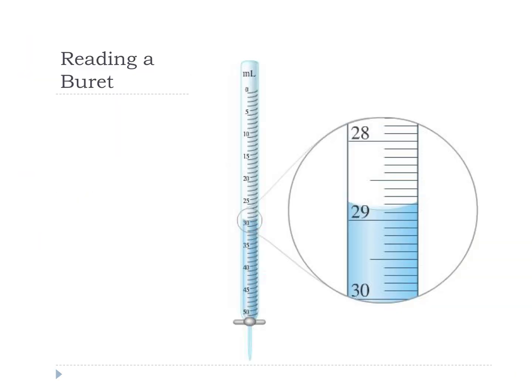At the beginning of the year, when we learned how to record measurements, we looked at how to read a measurement from a burette, and you had to practice this on your very first test of the year, but it has been a while since we've needed to look at one. So first, I want to remind you that when we use a burette, that's that long, skinny tube with the valve at the bottom, the purpose of the burette is not to tell us how much liquid is in the burette, rather it shows or measures how much liquid has been dispensed from the burette into another container.